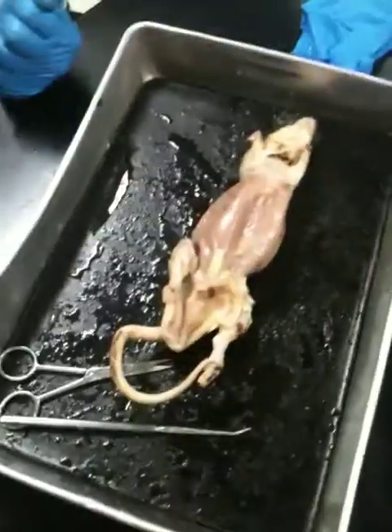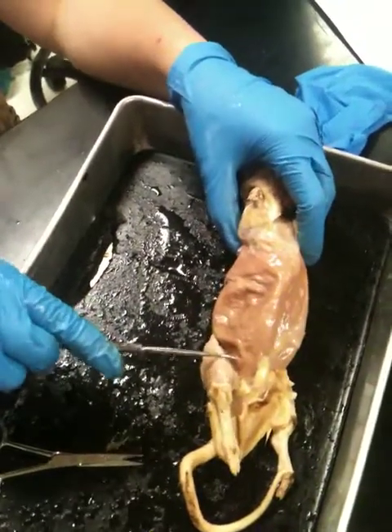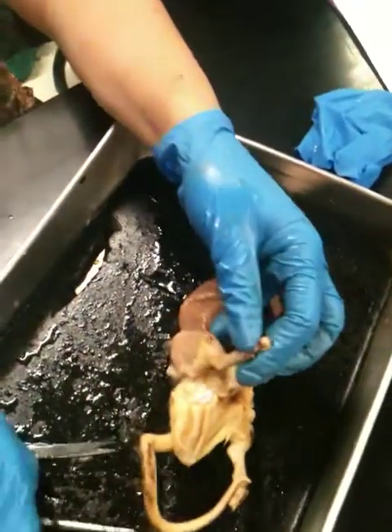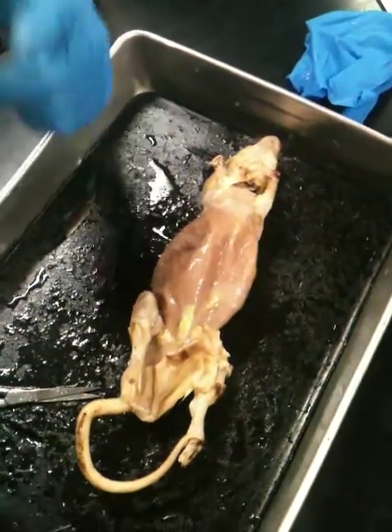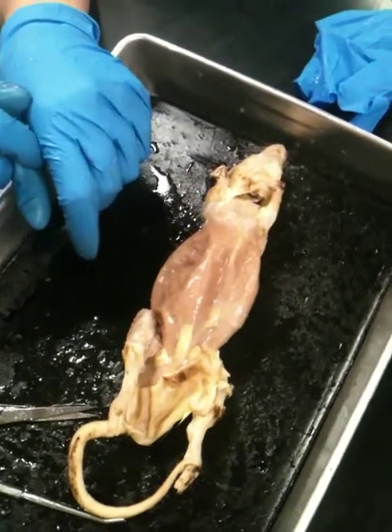Alright, so the patellar is going to be right here, just the bend right here. And the tarsals are on the front side of the heel, right? Just right over here and right over here, more lateral and medial. Yeah. So is that kind of like an ankle? Those are ankles. Tarsals are going to be ankles. We have those as well. We call them tarsals too.